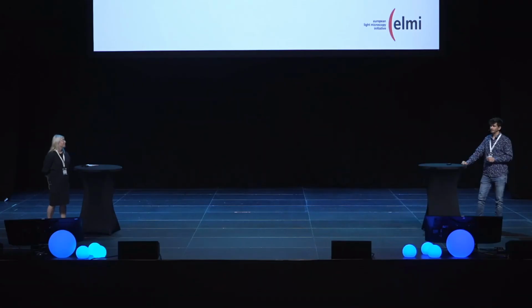For the moment, we are starting to focus on mouse brain, which is one of the models widely used in drug discovery. And that's an avenue to explore. I think there's more and more interest in rats and other model organisms, but at the moment we focus on the mouse brain.